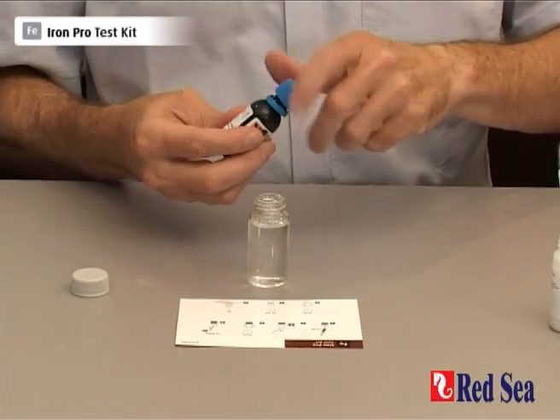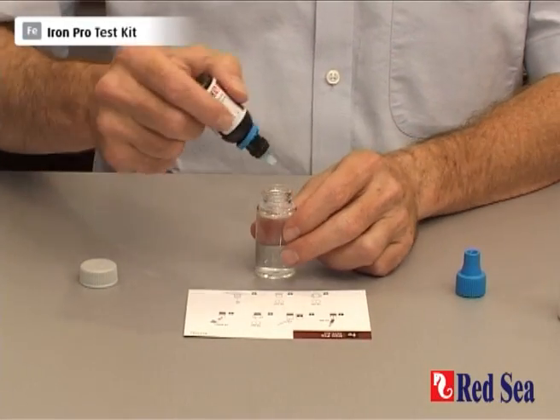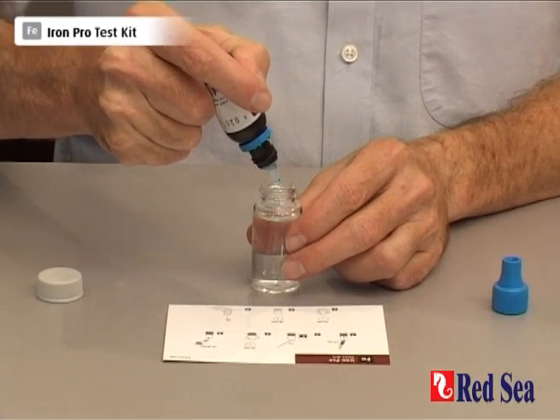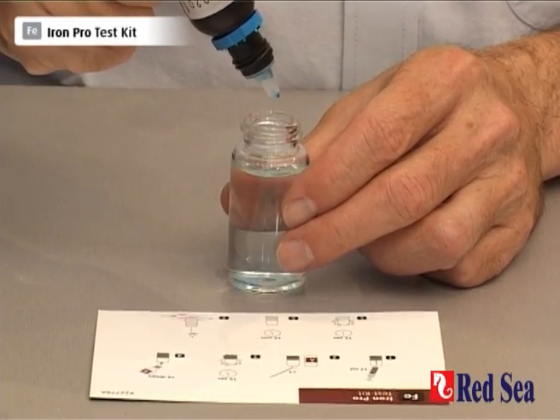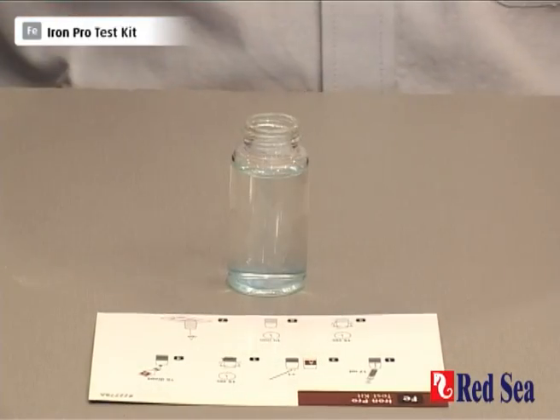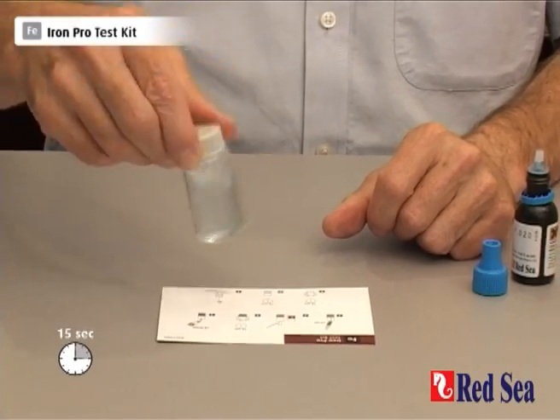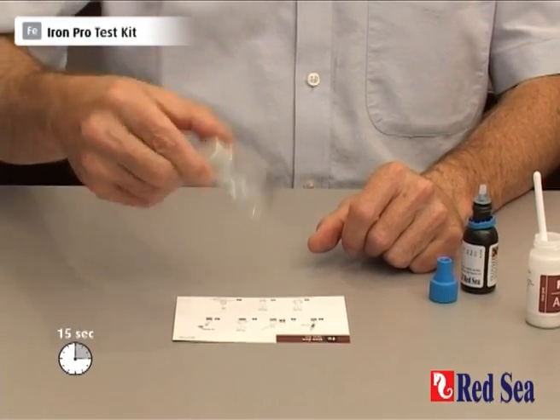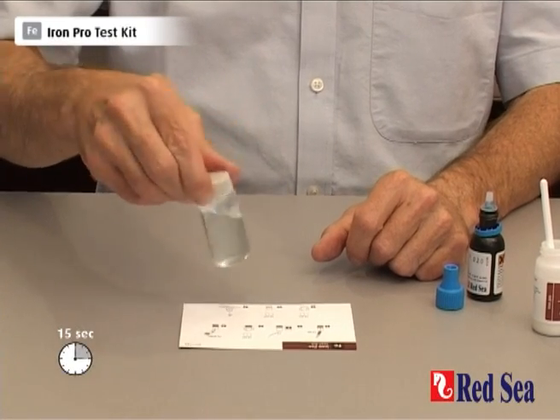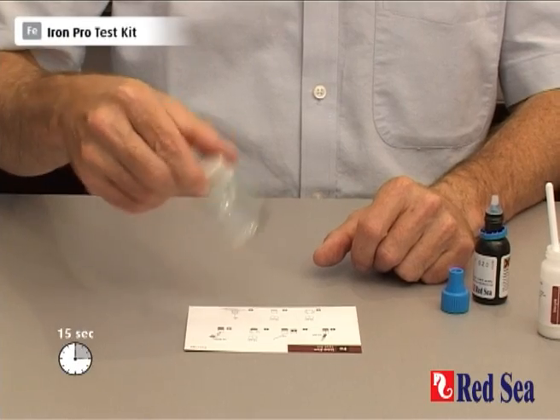We then need to add 6 drops of reagent B. Again, screw on the lid and shake for about 15 seconds — 12, 13, 14, 15.